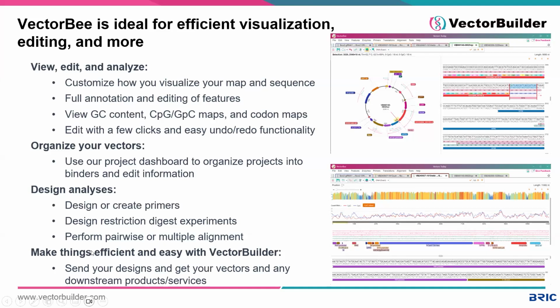And at the end of the day, you can utilize VectorBuilder from start to finish, from picking your vectors all the way through to actually creating your ideal vector that comes to you without needing to spend time at the bench performing those experiments yourself to just get this reagent. Your reagent can come to you and it can be exactly what you designed.